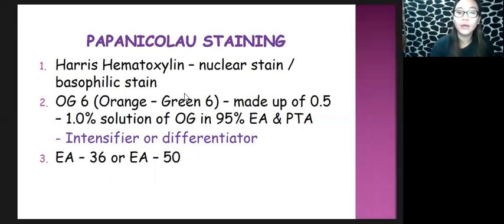Again, you have to bring your slides to water, because as I mentioned, one of the solvents commonly used to prepare stains is water. That is why there is a need for you to hydrate your smear so that it becomes compatible with the stain.